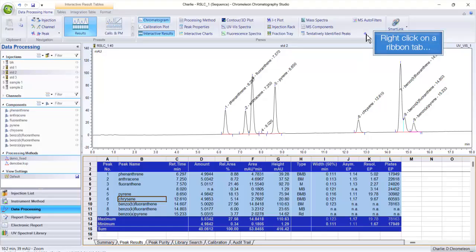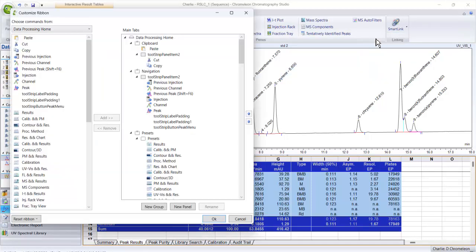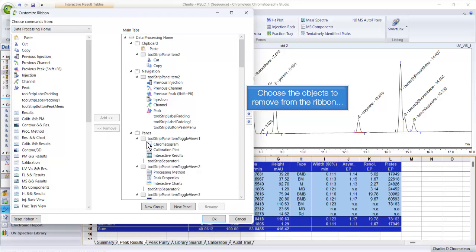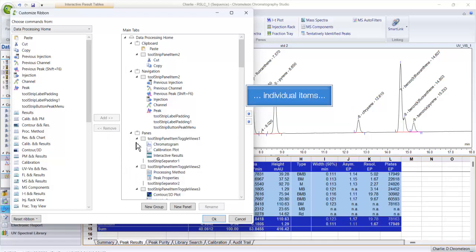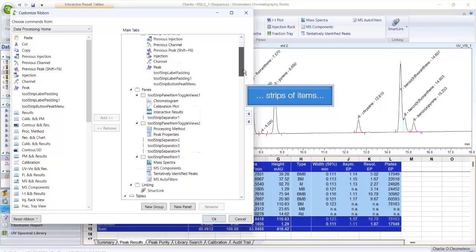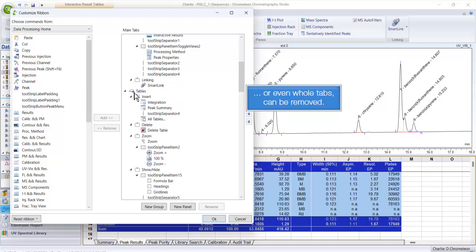Right-click on a Ribbon tab and choose Customize the Ribbon. Choose the objects to remove from the Ribbon — individual items, strips of items, or even whole tabs can be removed.